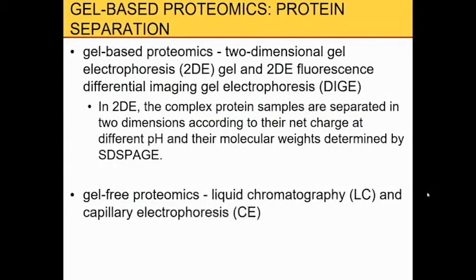Now, the SDS-PAGE can give a very good resolution of polypeptides. But sometimes a mixture of polypeptides is very complex, so we need an even better method to resolve it. This technique to resolve even more complex protein mixtures is called proteomics, right? Proteomics can help us to separate and identify an even more complex protein mixture.